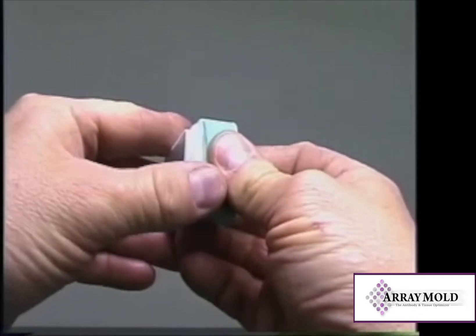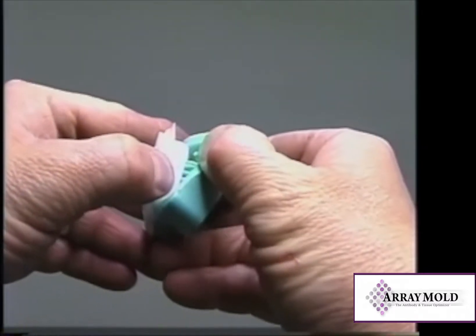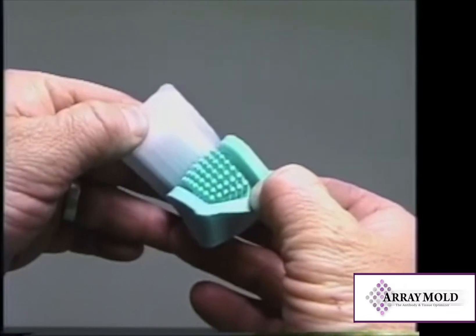Once the mold is cooled, pry it apart slowly. The punch rods inside the mold will stay intact for many moldings.